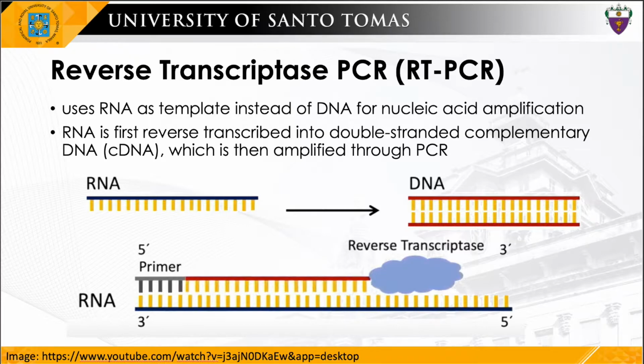So, in summary, RT-PCR starts by synthesizing DNA from an isolated RNA sample, then degrading the RNA portion of the hybrid through the RNase H function of the reverse transcriptase and synthesizing a double-stranded DNA. Reverse transcriptases in RT-PCR are thermostable and also generate cDNA with high processivity after the primer anneals to the RNA template. Next, amplification proceeds in the usual PCR procedure. However, the end product, the amplicon, remains a complementary DNA.